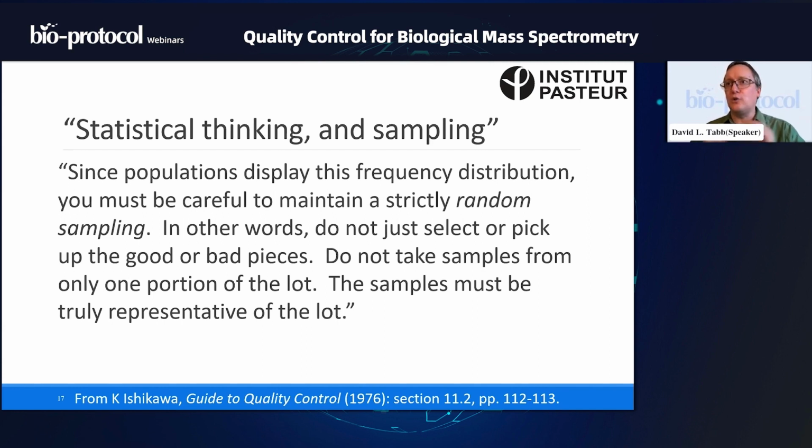if you try to learn how to keep your instrument running well by only looking at bad data, at failed experiments, you're missing half the story. A well-run experiment is not just one that is free from whatever caused this experiment to fail. We need to be able to think about all of the data, not just those of a particular set, if we're going to understand its proper use.